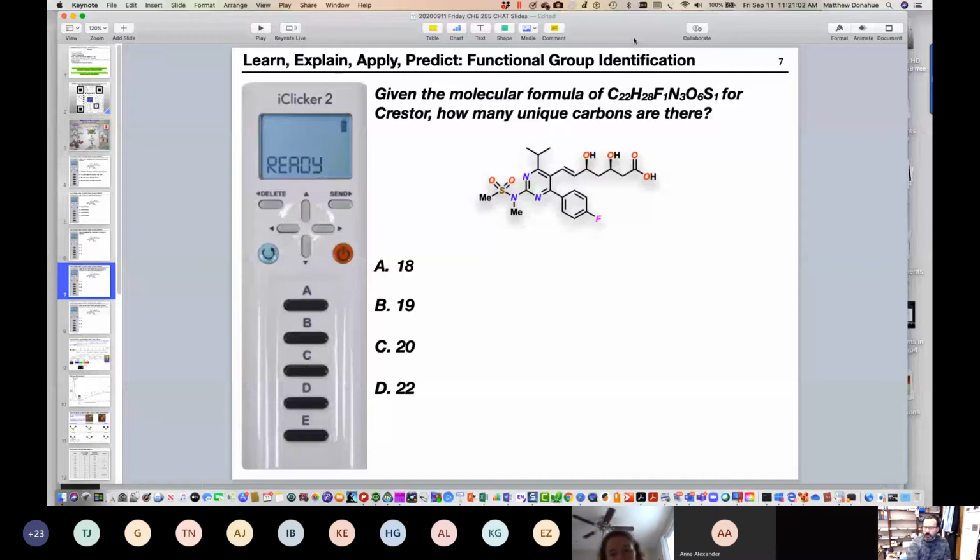So Blakely, one thing you can do is, as you're counting them, put a little dot or an asterisk, or if you want to use numbers, however you want to do it, to be your count. So from my recollection when I did this, the correct answer is B as in boy, but I can't write on my computer screen. Well, I would say just draw the molecule out real quick on a piece of paper.